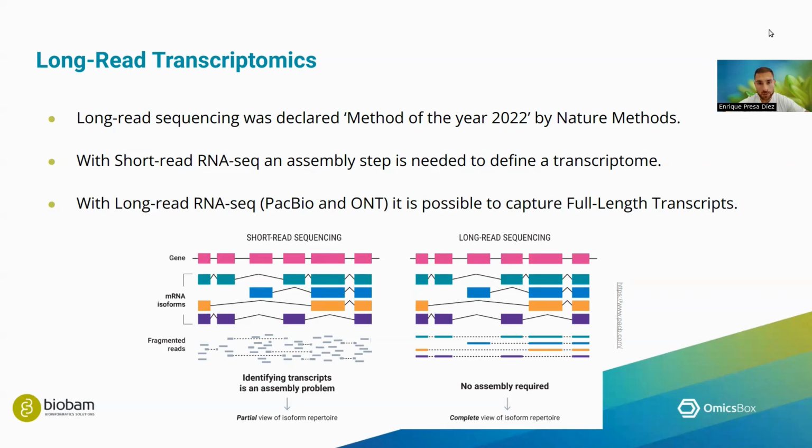And the answer to our question is that whereas with short-read RNA-Seq, you need an assembly step to define a transcriptome, with long-read RNA-Seq, no matter if it is PacBio or ONT, it is possible to capture full-length transcripts inside one single read.